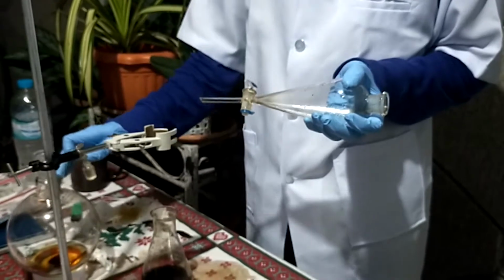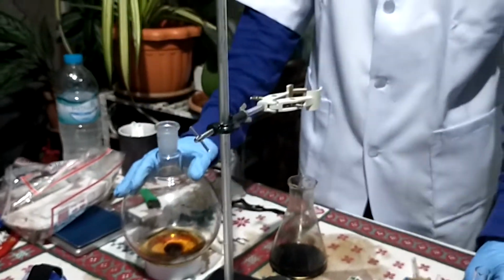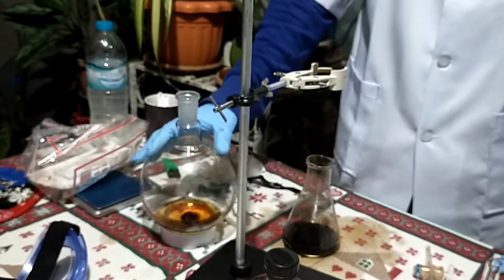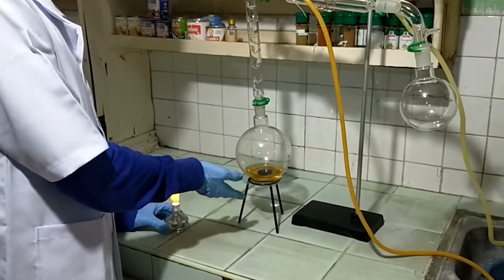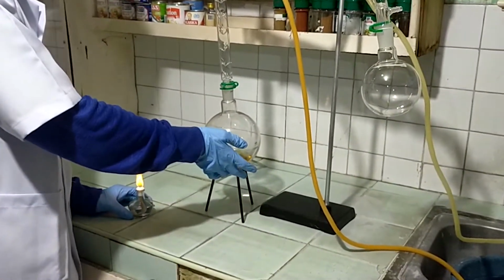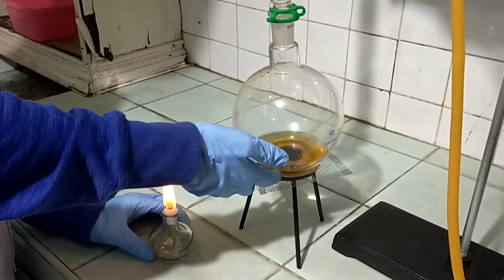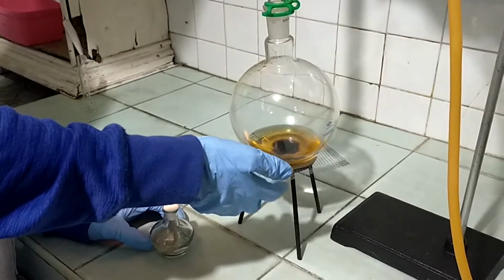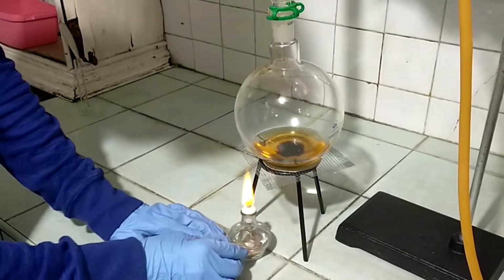Okay, what we're going to do now is we're going to distill off the ethyl acetate using our distillation set. And then once this has been dried, we're going to recrystallize it. So we want to distill our ethyl acetate so that the only thing we have here is caffeine. We would want to distill it until it's pure solid, so we don't want it to be wet in any shape or form. So here we go.